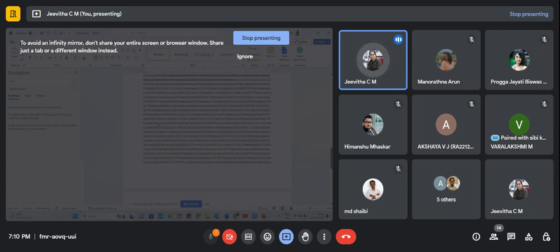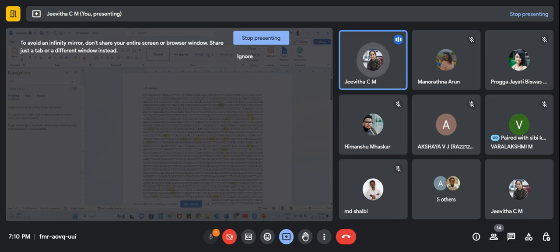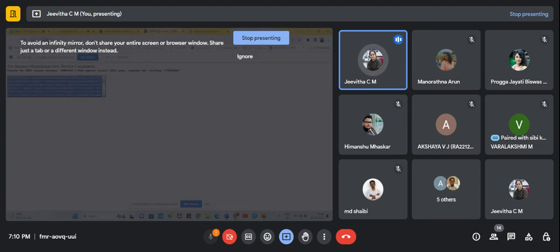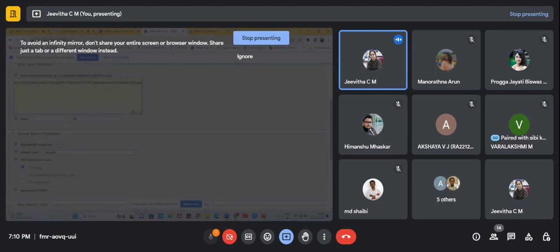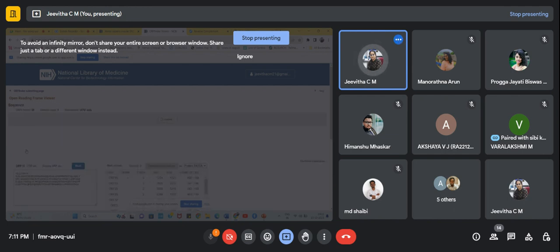Okay, so you have this huge data, and again, if you give ATG, you don't know where this begins, what the CDS region of this gene is. So we'll go for this ORF finder, and we'll provide the reverse complemented data here. When you have unknown sequences, this ORF finder is very important, because you actually need to know where the CDS region begins.